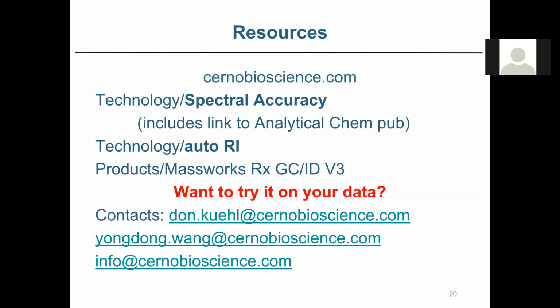So that's one of the reasons it can be a bit tedious to do an external alkane calibration. Once you get it nailed down, it's usually pretty easy as long as you're doing the same method. But with auto RI, that's why we did it, because a lot of times it's tedious or the person just hadn't run it. And if you hadn't run it, and then 2 days later you've trimmed your column, your GC is not calibrated anymore. But with auto RI, it doesn't matter.